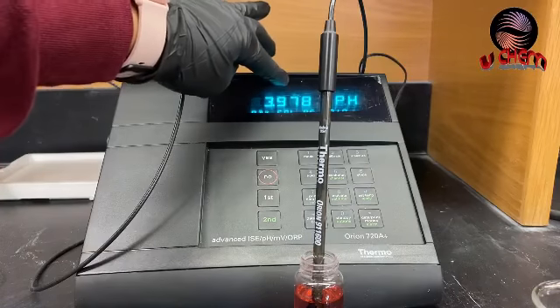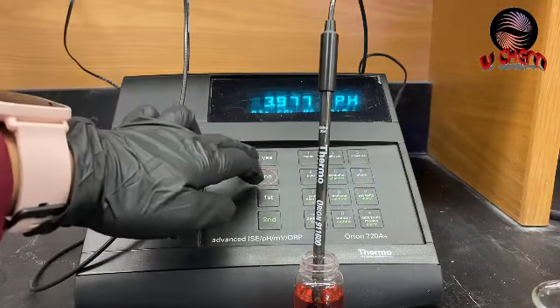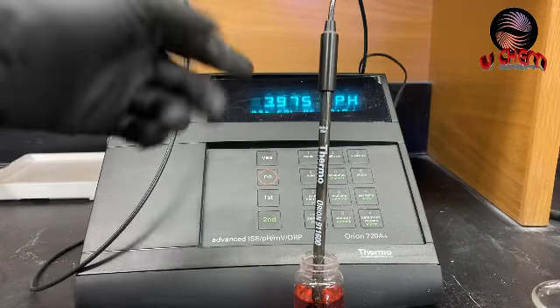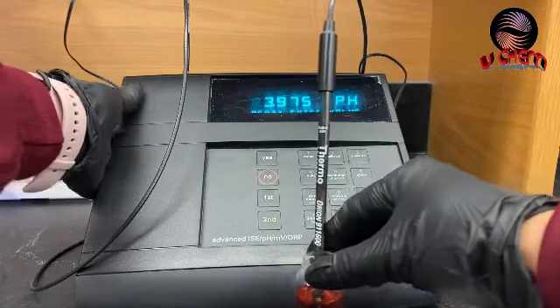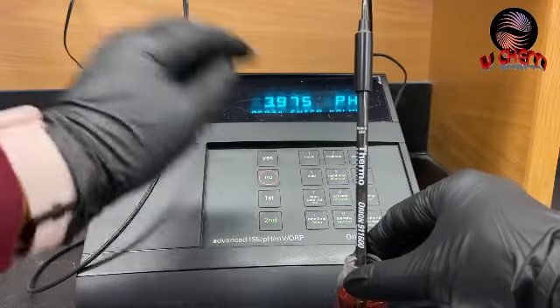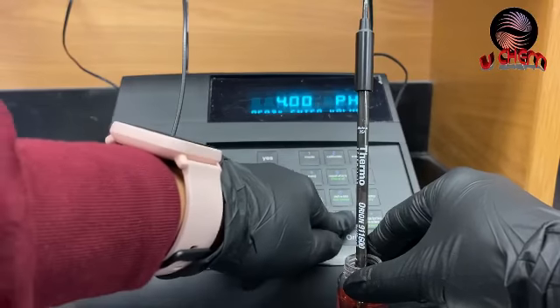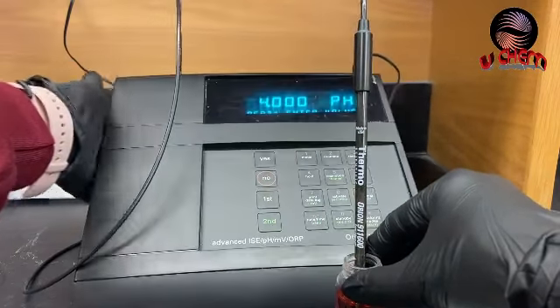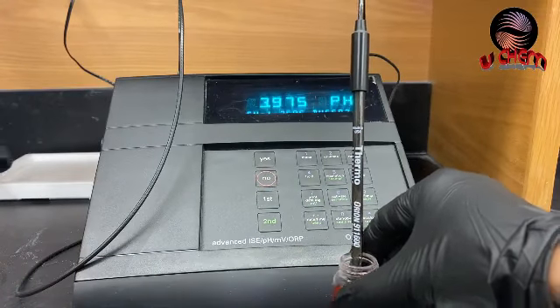The display says ready. If you're happy with the number shown, you can hit yes. But if it's far away from 4, you can hit no and then enter the value manually — I'll type in 4.000 and press yes. We are now done with buffer one.